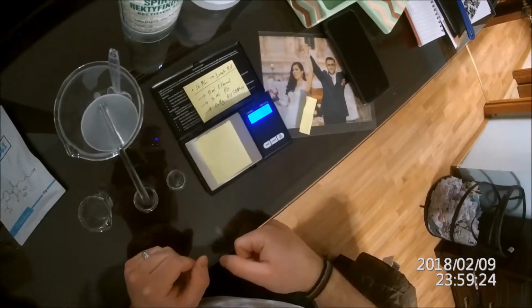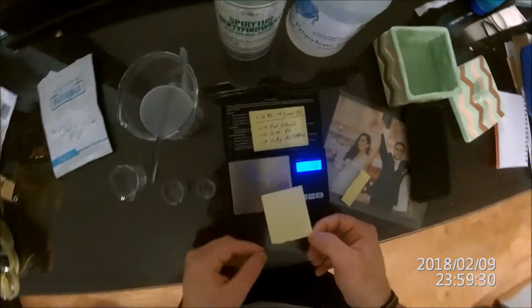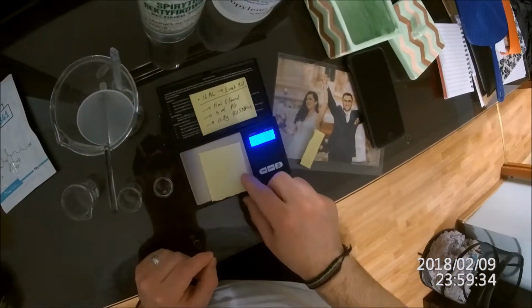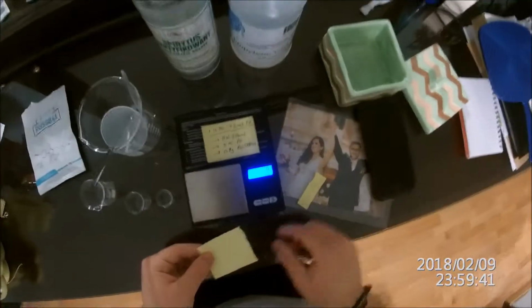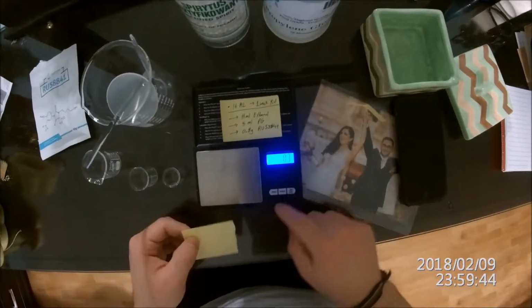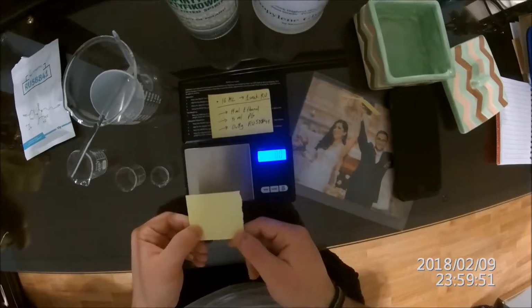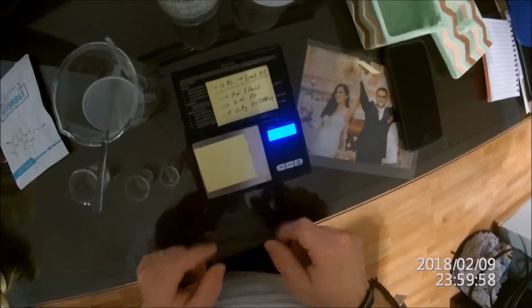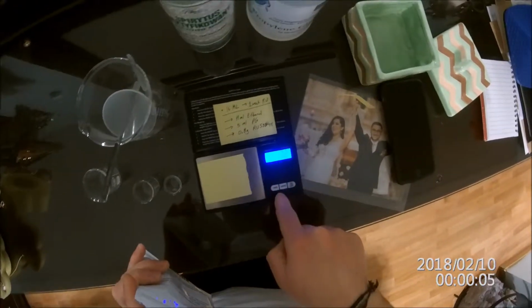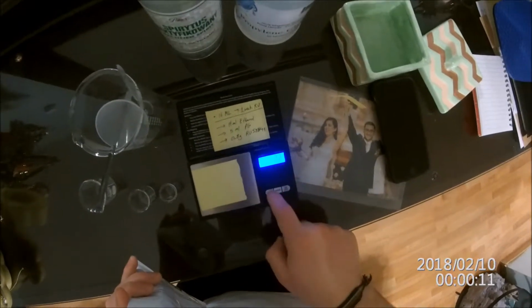So I put this paper on there. The paper itself weighs something. My scale isn't picking up the weight of the paper, but the paper weighs, I think, like 0.3 grams. So that's why this scale isn't super good. Like you see how it went to -3 now? Let me turn it on again. There. 0.2 grams is what this weighs. So what I want to do is set this to 0. So I hit the tare button so that it takes the paper into account and says it's 0.